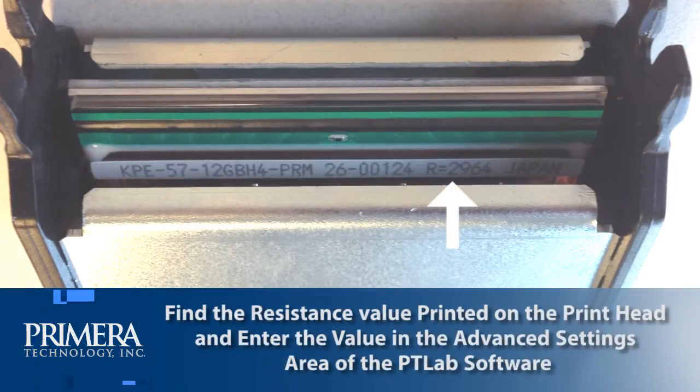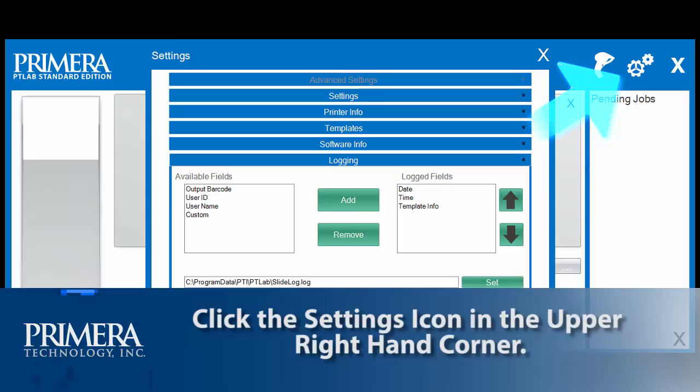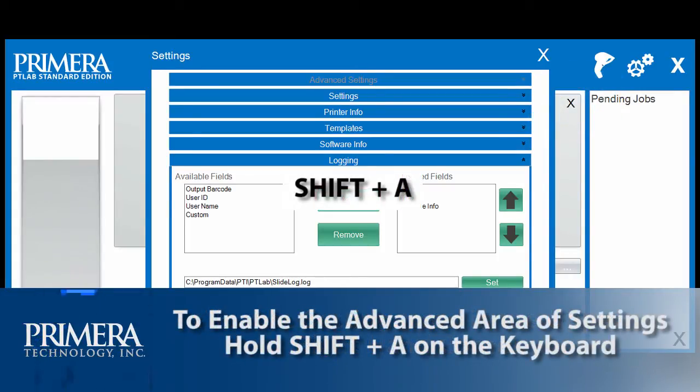Please remember to find the resistance value printed on the printhead and enter this value in the advanced settings area of the PTLAB software. Click the settings icon on the upper right corner of the software. To enable the advanced area of settings, hold Shift and A on the keyboard.